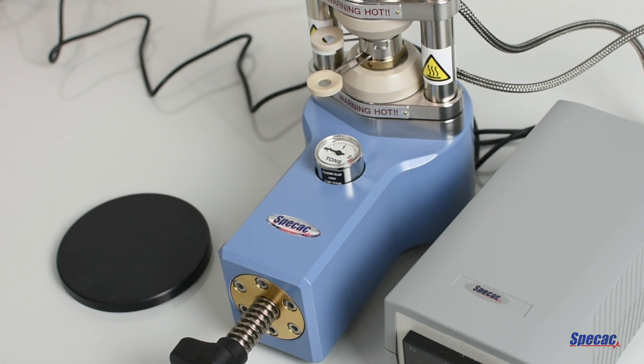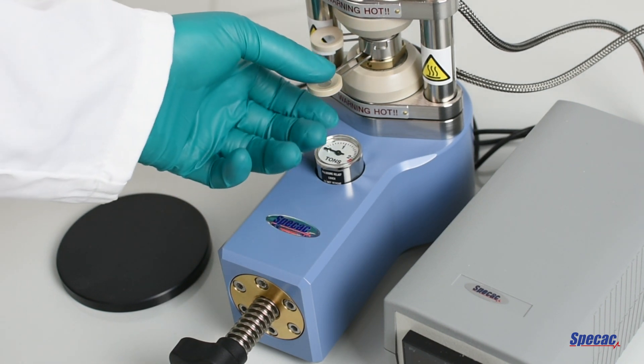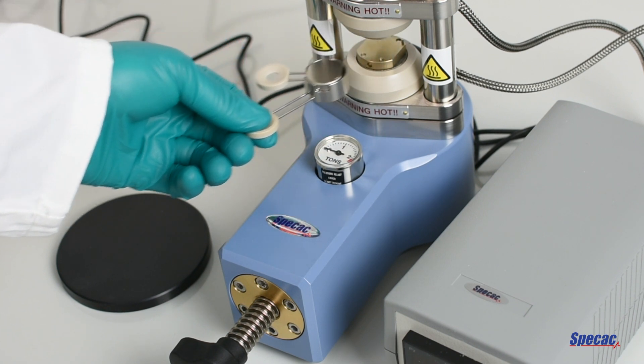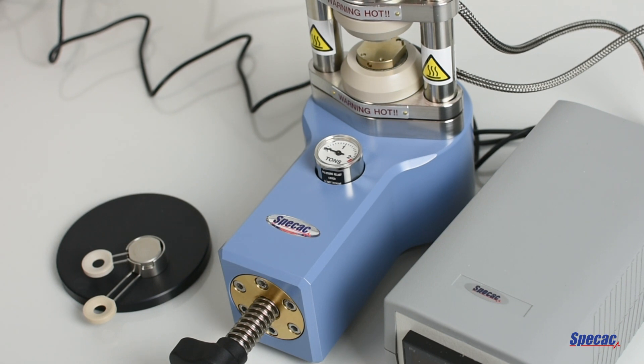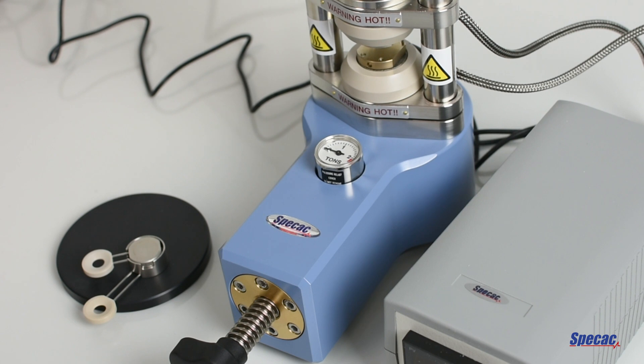Separate the heated surfaces further using the lead screw to aid in the removal of the film maker assembly. Now, very carefully remove the hot film maker assembly and place it onto the cooling plate. At this stage, re-tighten the lead screw assembly to bring the heated surfaces back together to prepare the temperature of the press for a new sample.